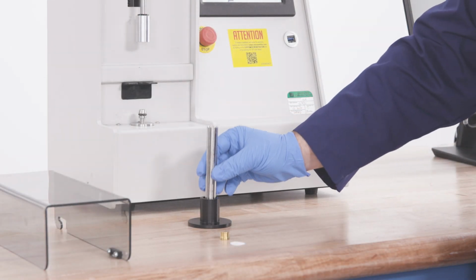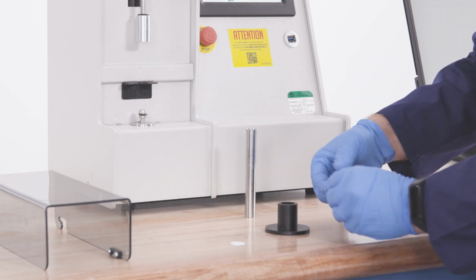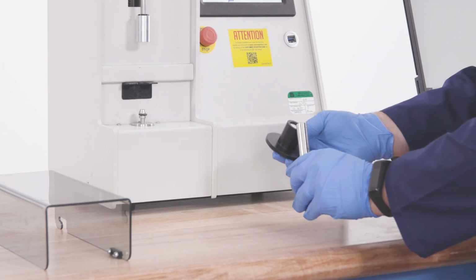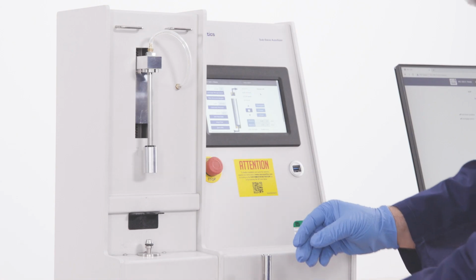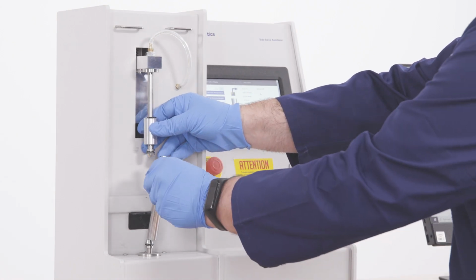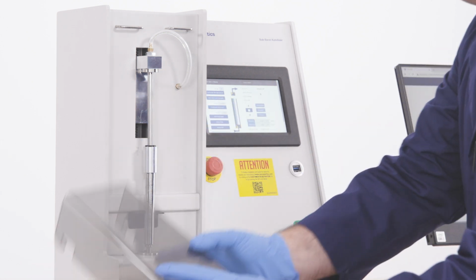Once you add the sample to the sample tube, you use the sample preparation tool to place the second brass plug and filter on top like this. Place the sample tube with the sample on the anvil and bring down the piston guide. Place the safety shield on.